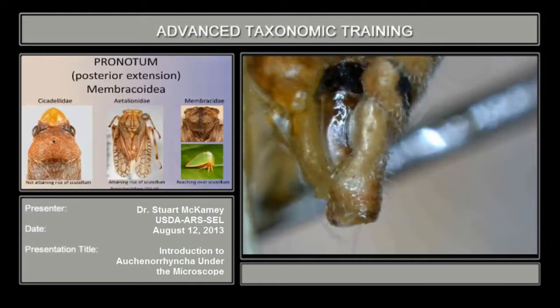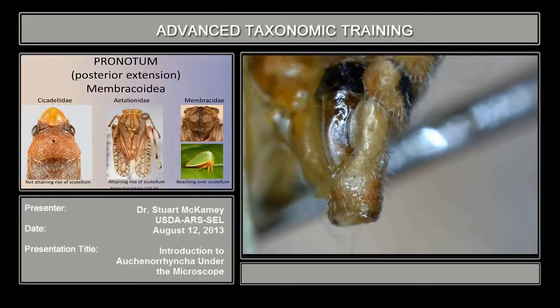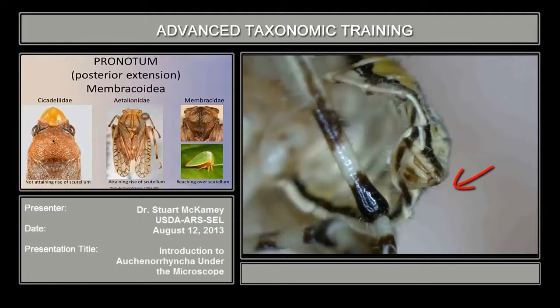As an aside, you can identify treehopper immatures because they always have a fused terminal segment forming a tube, fused ventrally. This is the ninth segment, and here it's ventrally fused — this is a ventral view, and it's fused. Everything else, including the atelionids, is unfused — you can see the two sides coming together. Putting an atelionid immature under the scope, there's no tube. The sides may be pressed together, but there's no fusion.